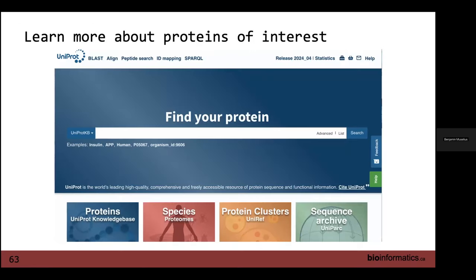So a great first step, if you have a few proteins that you've noticed are up or down regulated or show other things of interest in your experiment, is going to UniProt. How familiar in general, or how many people have used UniProt in some capacity? Okay, so most of you are at least familiar with what it is. UniProt is a database containing protein information.